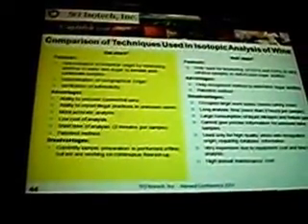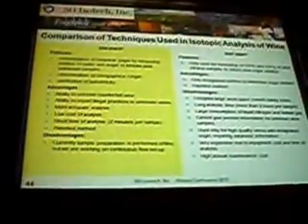So comparing the techniques, what we can do: determination of botanical origin by measuring addition of water and sugar to known and unknown samples, determination of geographical origin, also the ability to uncover counterfeit wine, more accurate analysis, low cost analysis, short time analysis, we take only 2 minutes for analysis. Okay, it's a patented method, and the only disadvantage at this moment is that currently sample preparation is performed offline, but we are working on a continuous flow setup. And this is at the end.